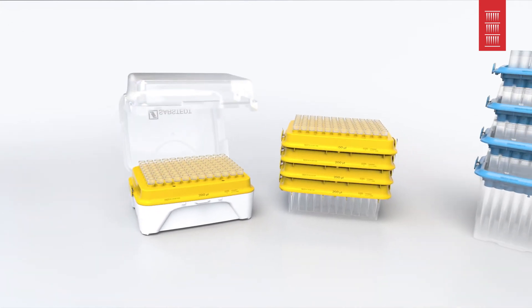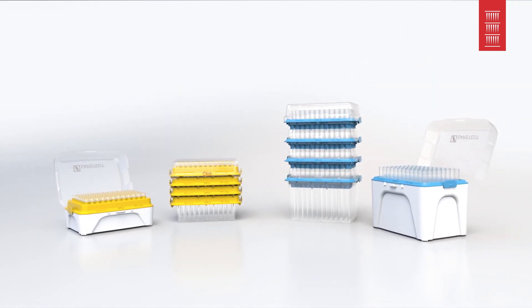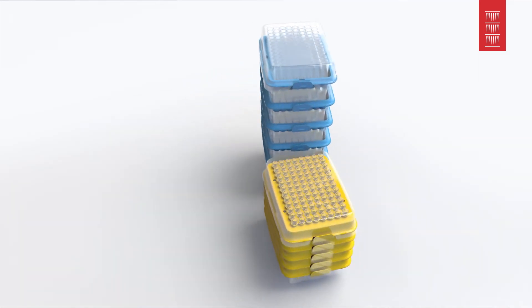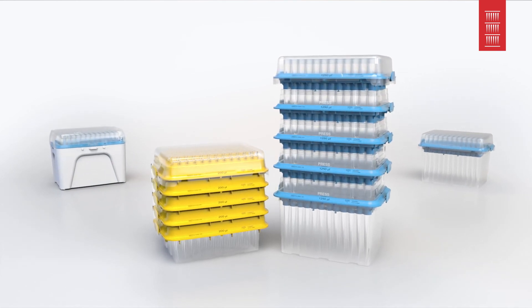You can then lift the cover up and press back onto the StackPak for safety. The freshly filled box is now ready for your next tasks. Efficient, sturdy and economical — the StackPak.